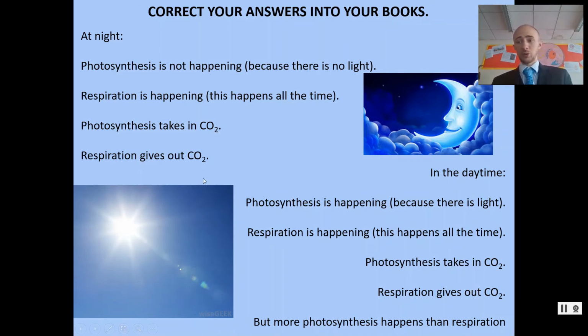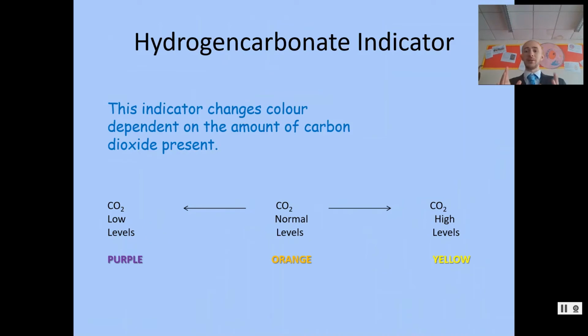Why do I ask about these questions? What's the point of these questions? The point is we're going to talk about this indicator called hydrogen carbonate indicator. And it changes colour based on the amount of carbon dioxide present.